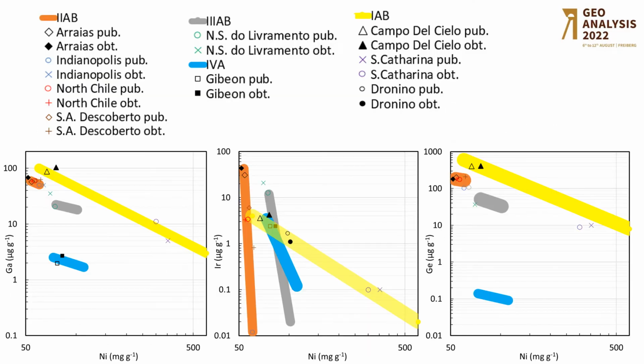We plotted the obtained and published composition for the 9 studied iron meteorites on classical chemical classification diagrams and can affirm that our results lead to the same existing chemical classification for the analyzed materials, and therefore our procedure is fit for purpose.